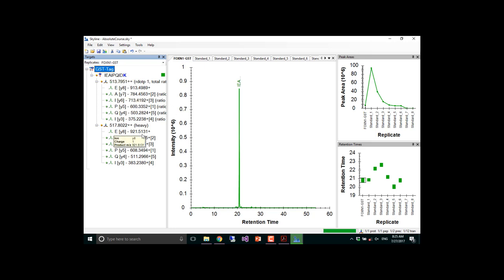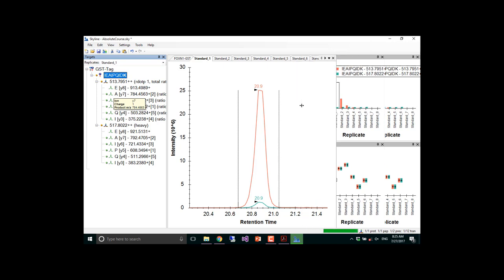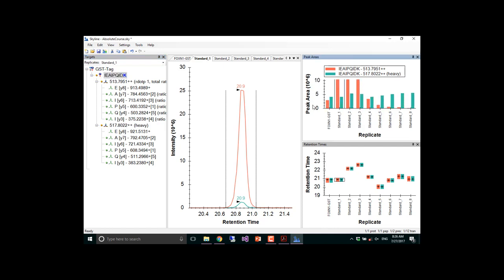And you can see, sure enough, why it wasn't measured. You can sort of see the shape of a calibration curve over in peak areas. You can click on the peptide and look at the peptide. Then you'll get a view of the heavy and the light beside each other, and see that the heavy is fairly constantly injected, but there's some variance in there.